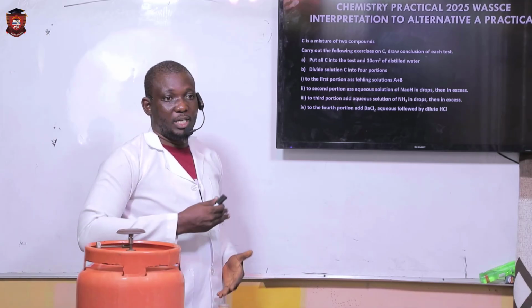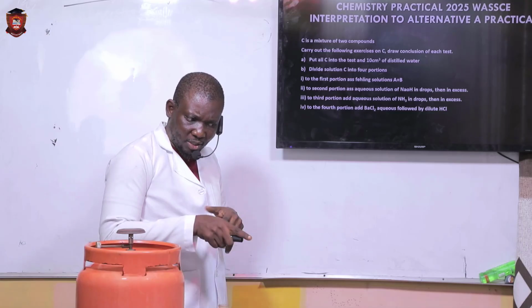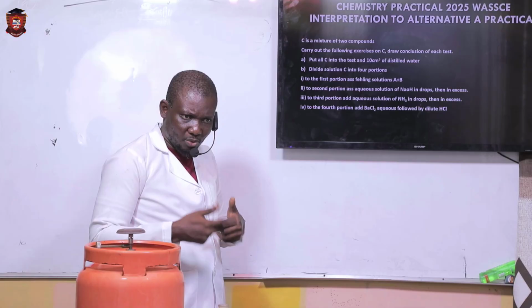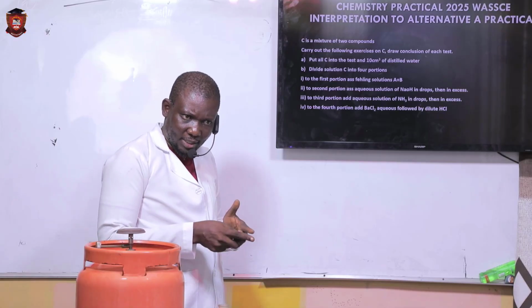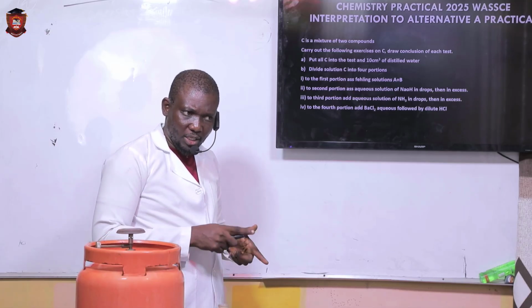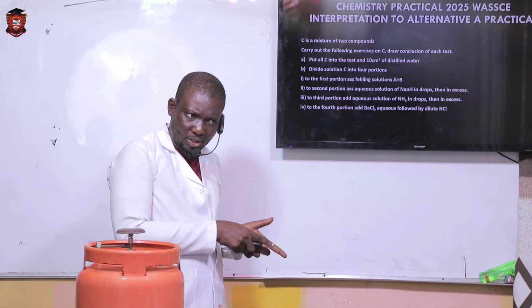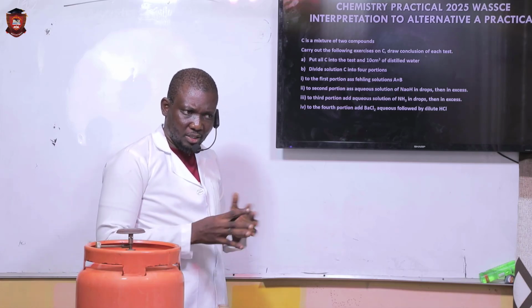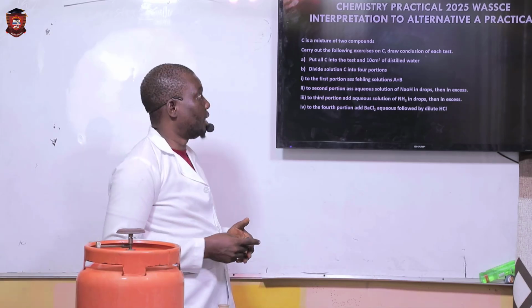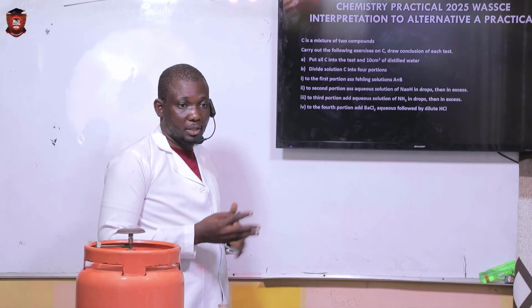So in the course of identification, you start to see some behavior of some ions, and you start to see something going on in the test tube. And one can start to think, it looks like this is a copper salt. If on warming something gives a brick red precipitate, it seems that it must be reducing what? Sugar. So all of these things you take into consideration. That is when you conclude that these two mixtures must be a copper salt and a simple sugar.